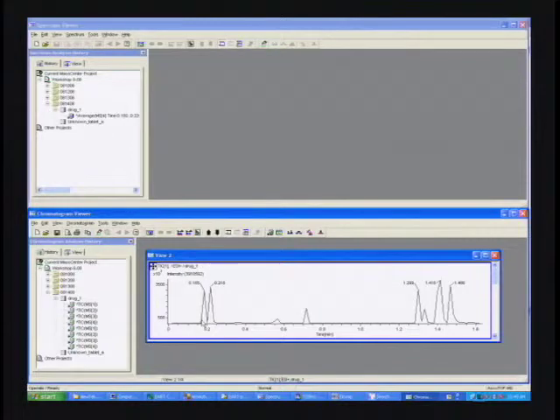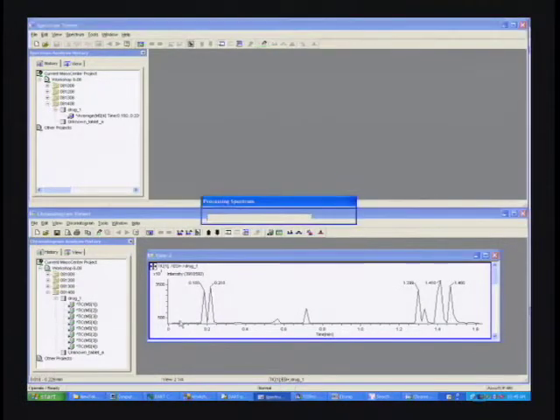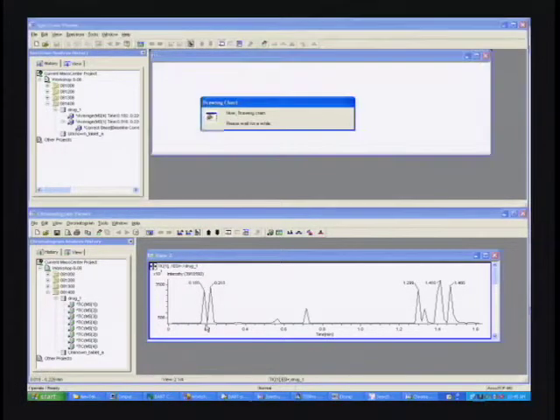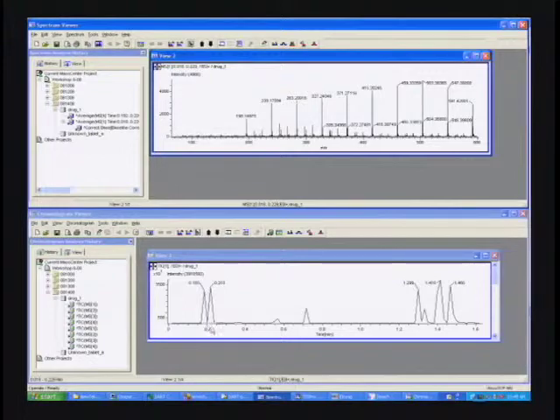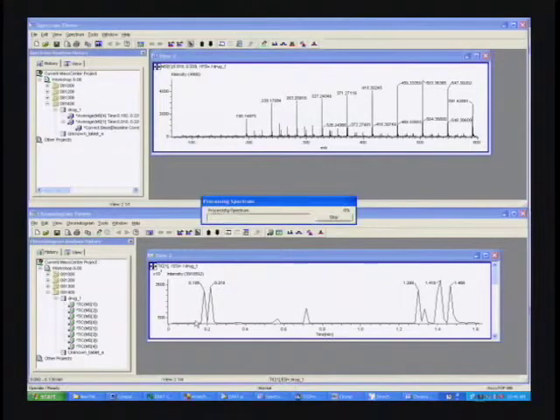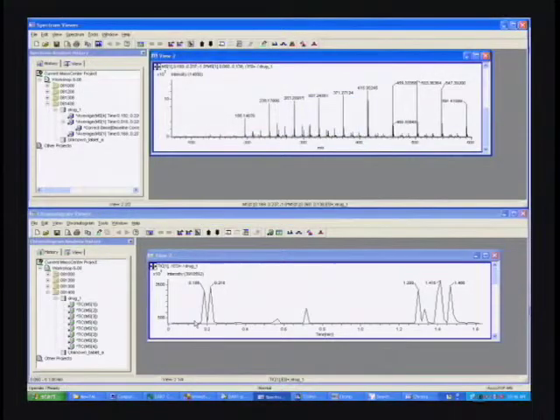So the first thing we will do is take our polyethylene glycol peak, and we'll get a spectrum up. And that's not necessarily the one we want. We'll take another one here. Now we're doing an averaged subtracted spectrum, and it looks essentially like that.